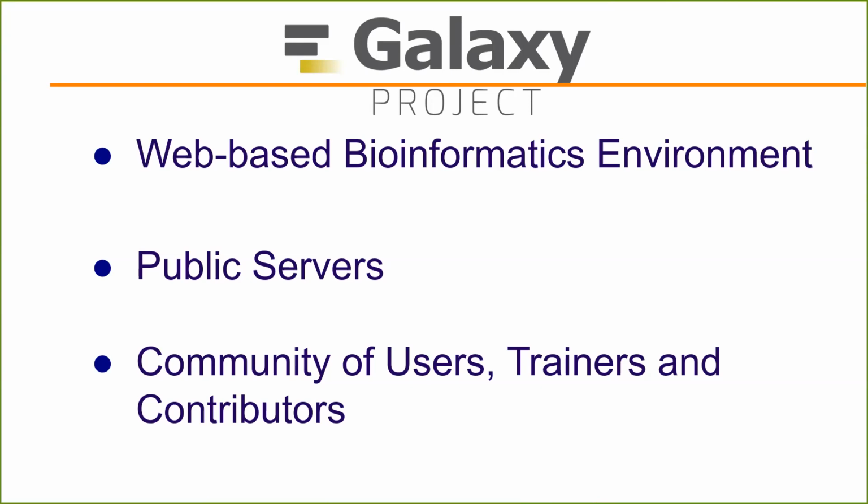has access to quite a lot of high performance computing environments behind the scenes. You don't need to worry about that, but it does mean that you've got a freely accessible place to do your Galaxy analysis, and they give you by default 250 gigs of data.